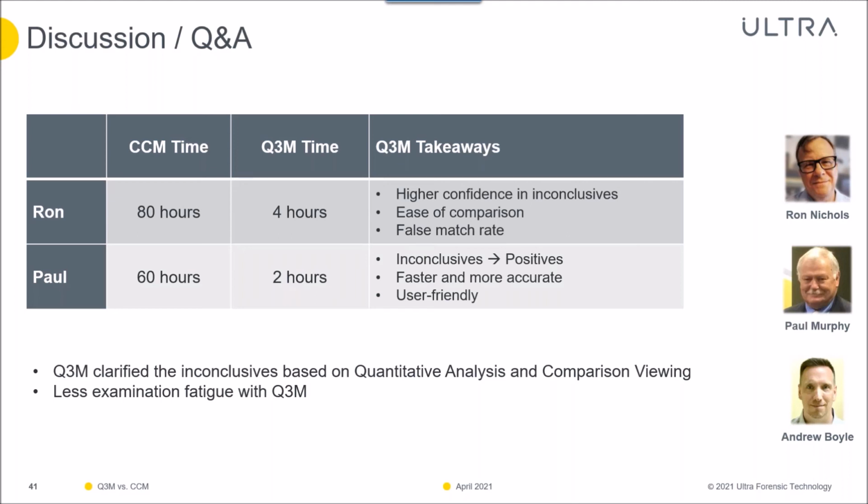And I think for some of those more difficult ones, just the fatigue that you get into, like working with polygonals or on some of these ones that were so similar, the fatigue that you go through mentally must be a factor as well. Sorry, Ron, I cut you off there. No, it's okay, Andy, and that's true. The fatigue is an issue. There's a lot more data to work with, so I do believe that there could be, as Paul experienced using his Leica, less inconclusives when using a quantum 3D microscope.